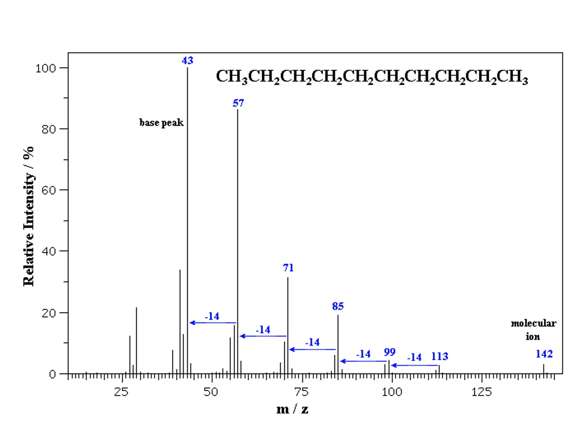And one of the things that one has to appreciate when looking at a mass spectrum is that every single peak is not one that we at this level would need to consider and spend any great detail of time trying to identify.